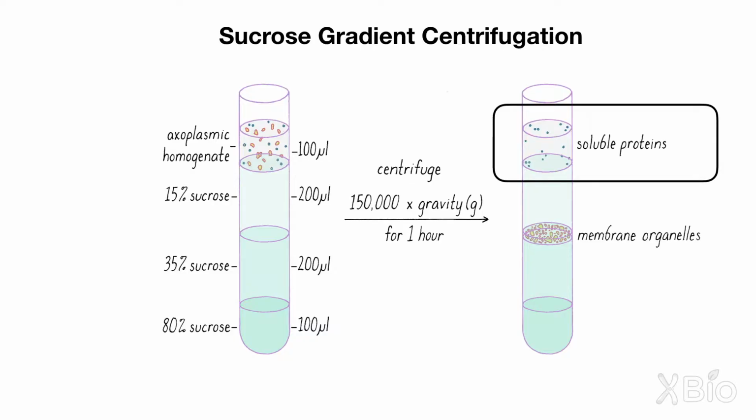But one thing you learn in biochemistry is to keep all of your fractions when you do an experiment, whether you think you may need them or not. In fact, we kept other parts of that sucrose gradient, including one fraction which is at the very top of the sucrose gradient, which was the soluble protein fractions. And again, we just put that aside and also placed it in the ice bucket, just in case we needed it later.